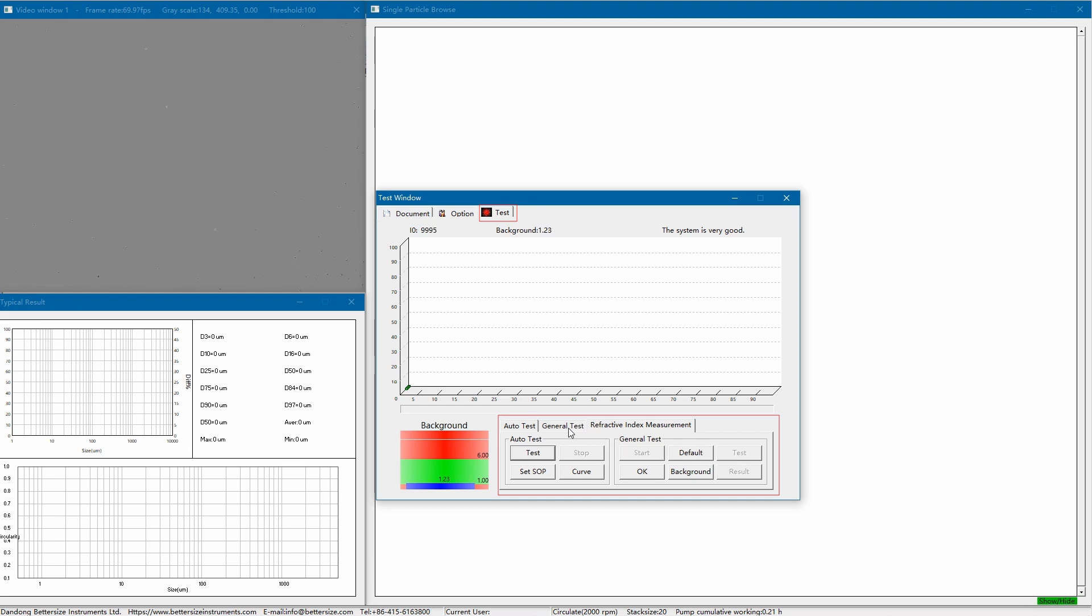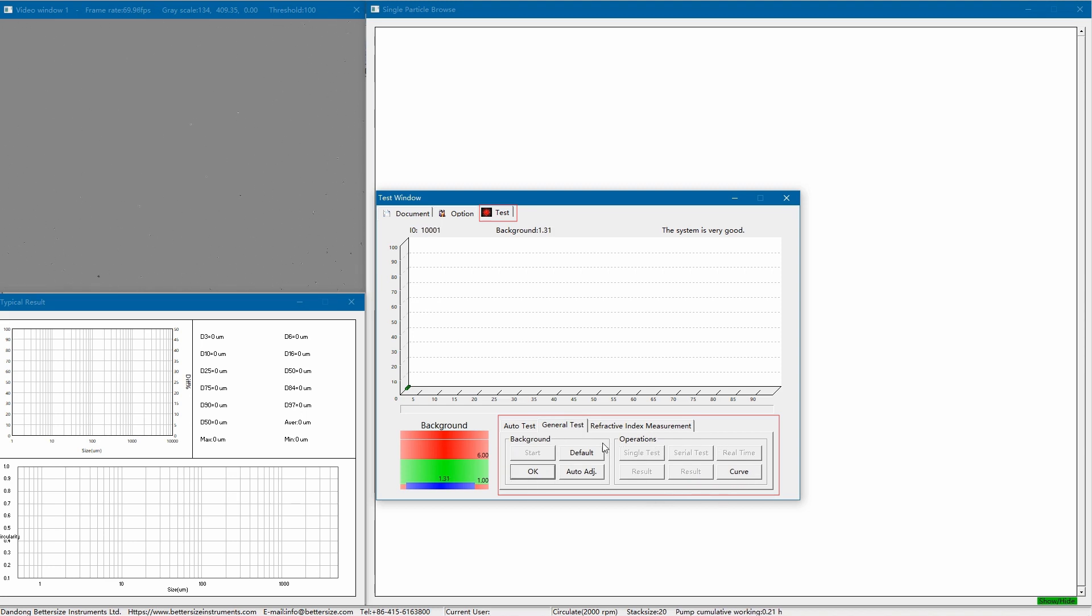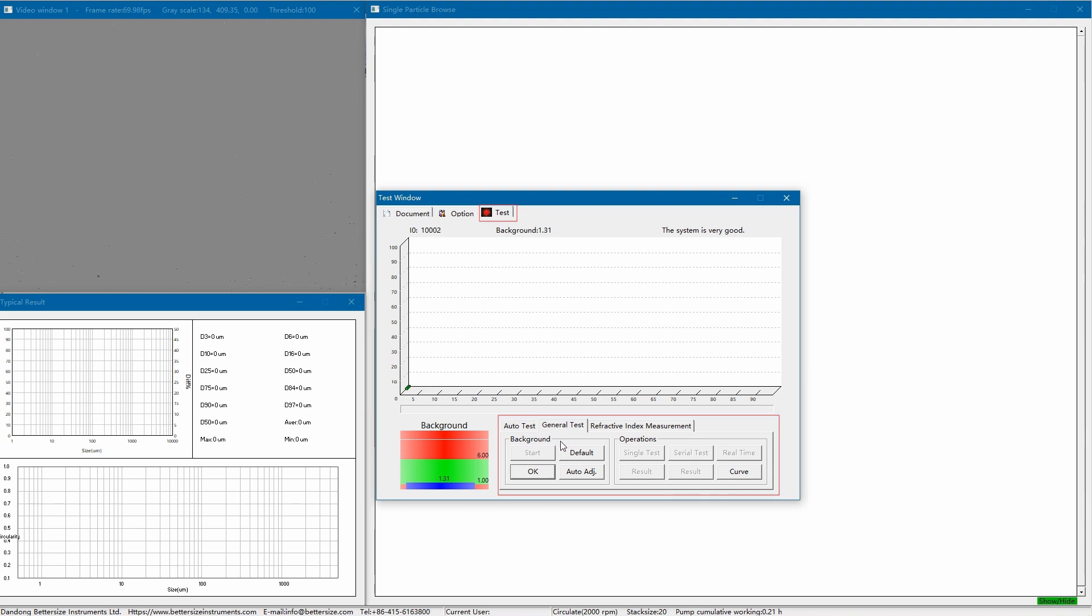General test is suitable for unfamiliar samples, which require methodological studies. It allows you to control your measurements in multi-steps. And it is recommended to determine appropriate measurement parameters in the general test first, especially for unknown samples before using the auto test.